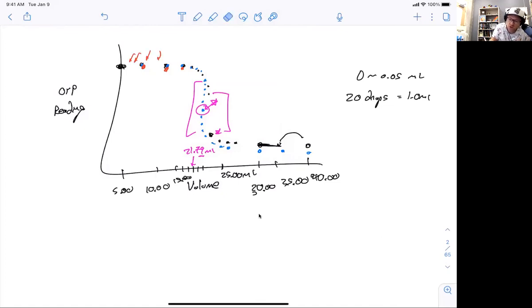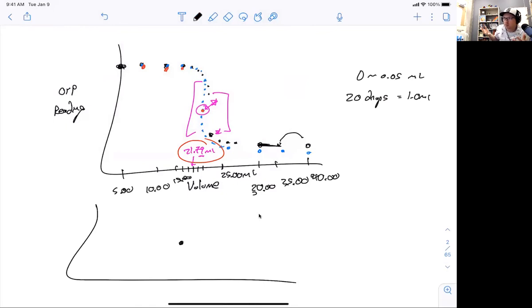Your titration curve will look really, really good, but we only use one number, this one volume at the equivalence point, to do all of your calculations. None of the other ones we use. They're just there to help us find this one, because you can't just go through a titration and get one. How do you know that's the equivalence point? You don't. So the other ones are there to help you find this one, but you don't need a lot in the flat regions.